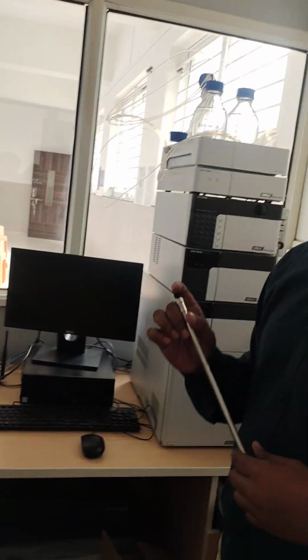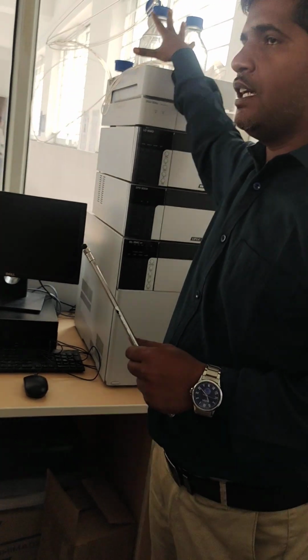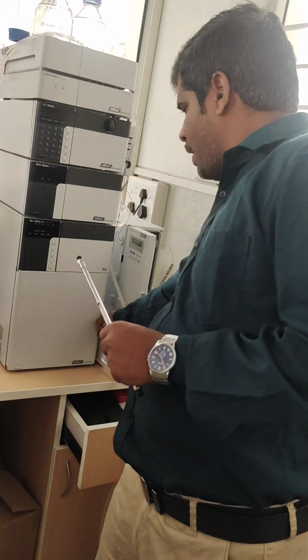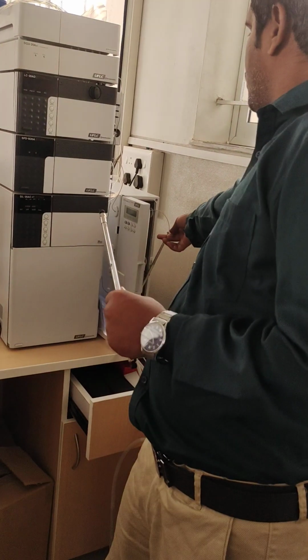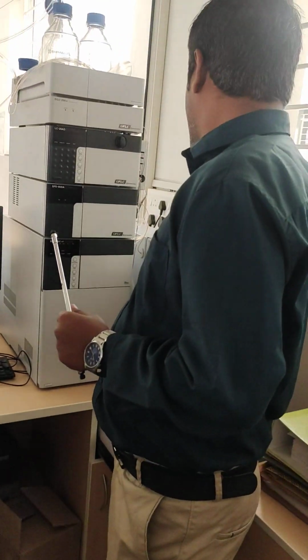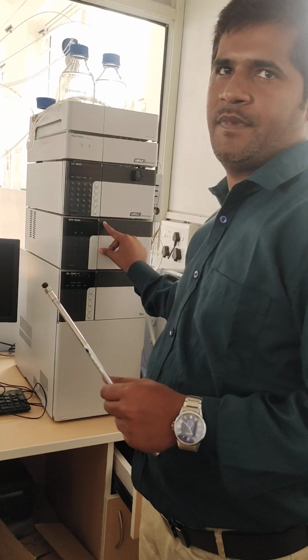The flow of direction. What is the flow of direction of your mobile phase? Sample cell or solvent reservoir, degasser, pump, premixer. The premixer will provide the mobile phase here, and it comes to the column and passes in the upward direction. In which direction? Upward direction. And this mobile phase reaches the detector.